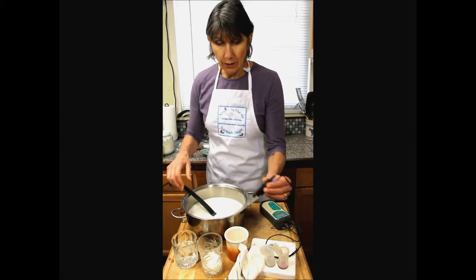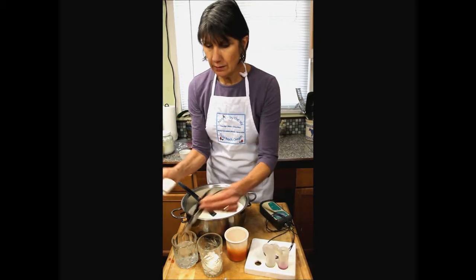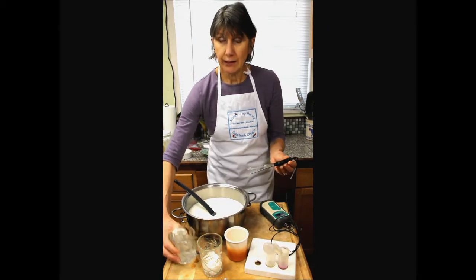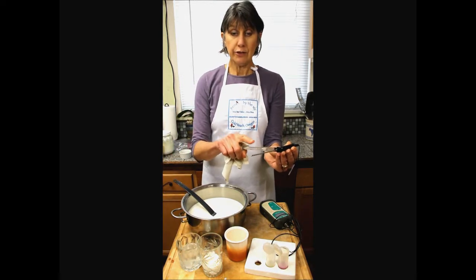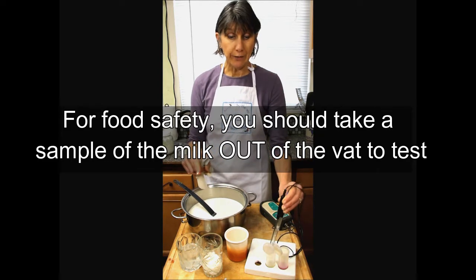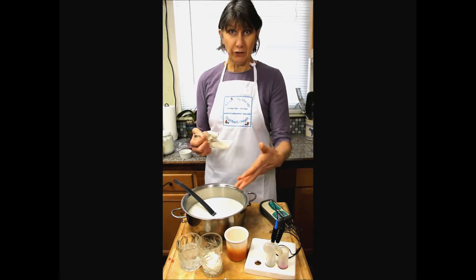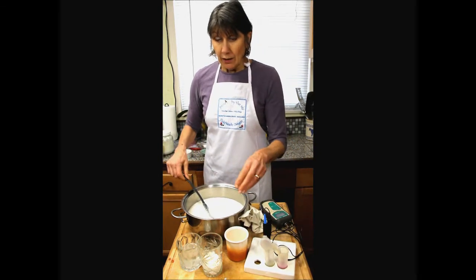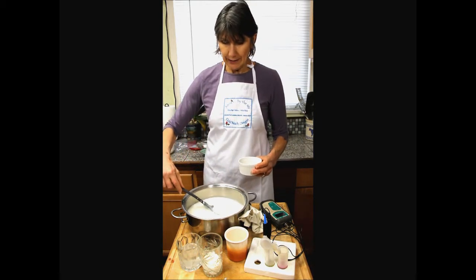Okay, so now I'm going to rinse the electrode, blot it off. And if you're rinsing in glass, be very careful. These little electrodes are very delicate. And this one, particularly being a spear tip, you can shatter it in your glass. By the same token, don't take it from a cold solution to a super hot one because you'll break it. So we're going to add our rennet now and then let this coagulate.